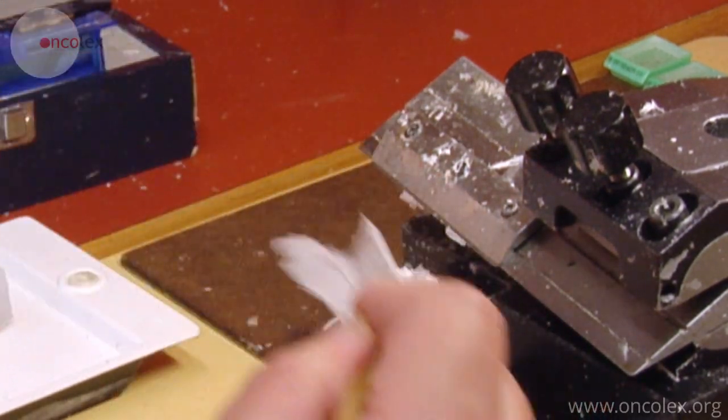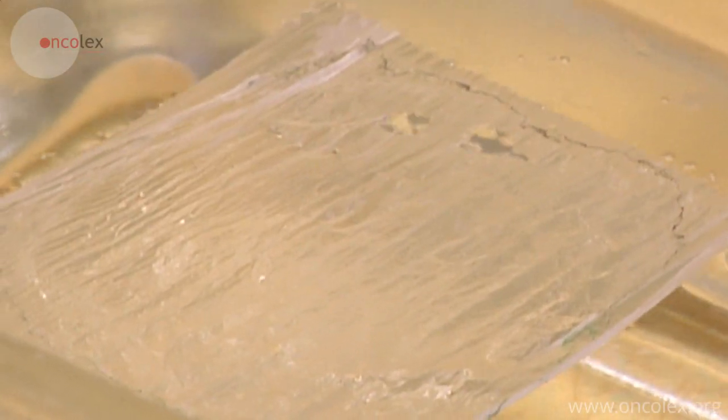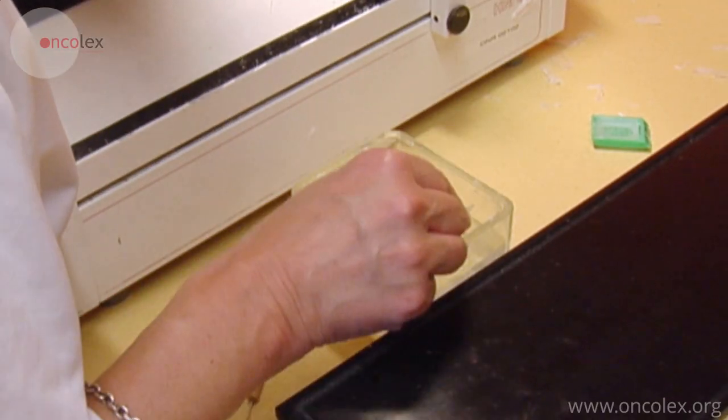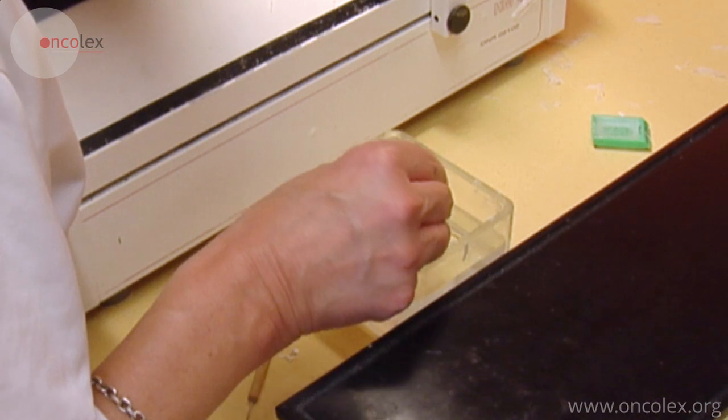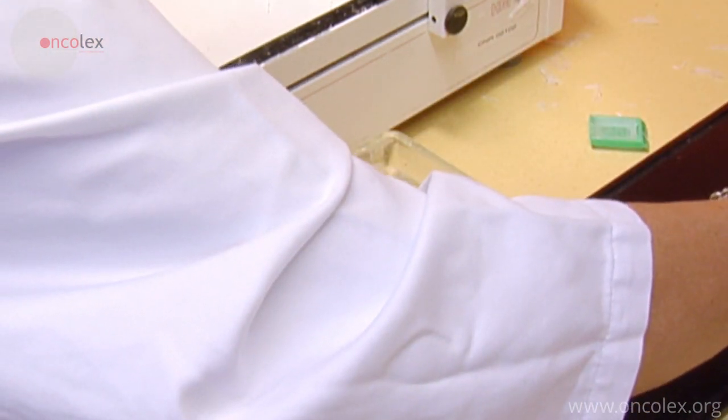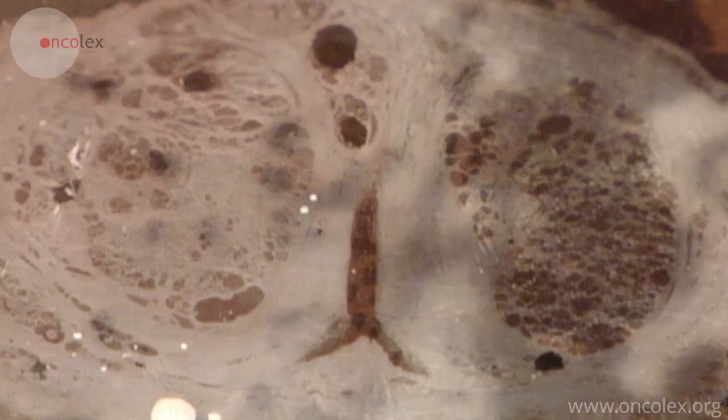The section is carefully placed in distilled water, then transferred to a slide and placed on a hot plate. The slides are placed in a 60 to 80 degree Celsius heating cabinet for at least 30 minutes to keep the sections from falling off the slides.